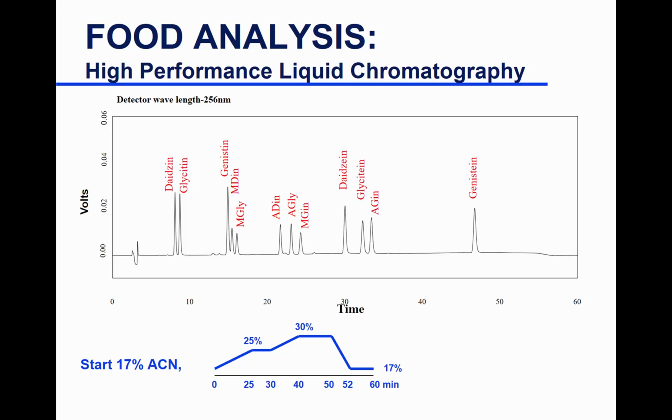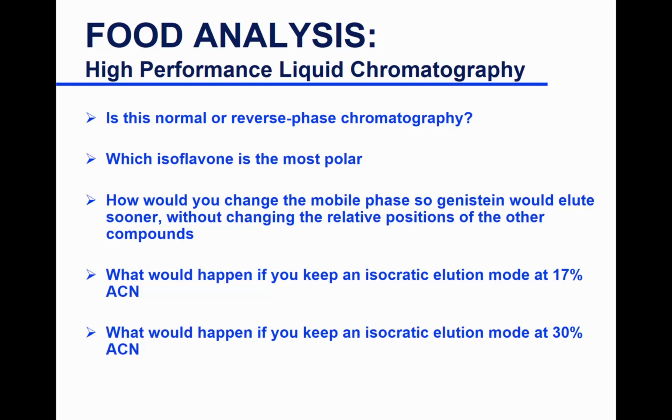So after the last one here comes out, I can increase my concentration of acetonitrile a little bit beyond 30%. I will encourage this compound to come out sooner. All right.